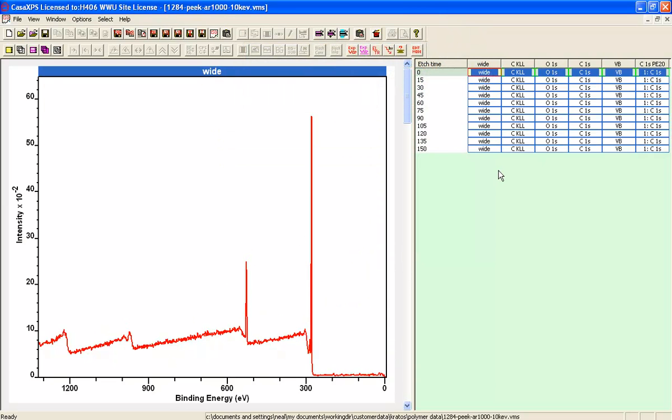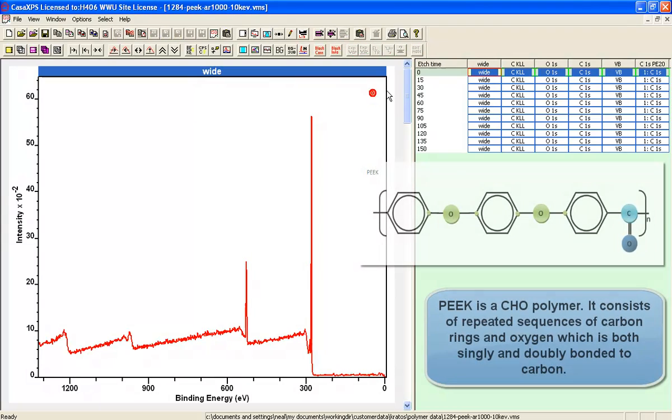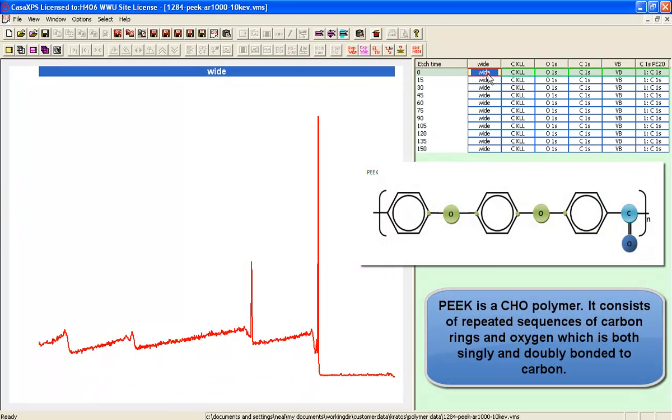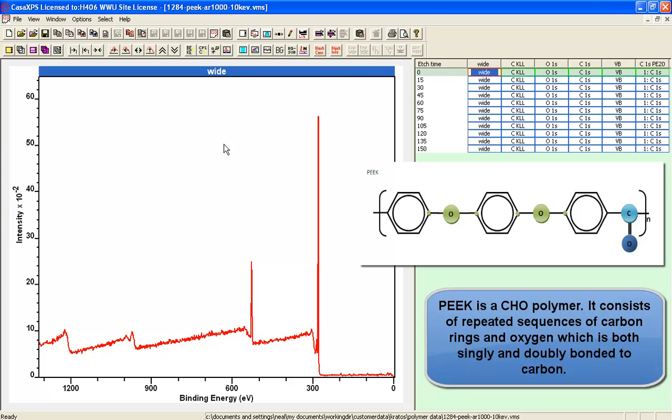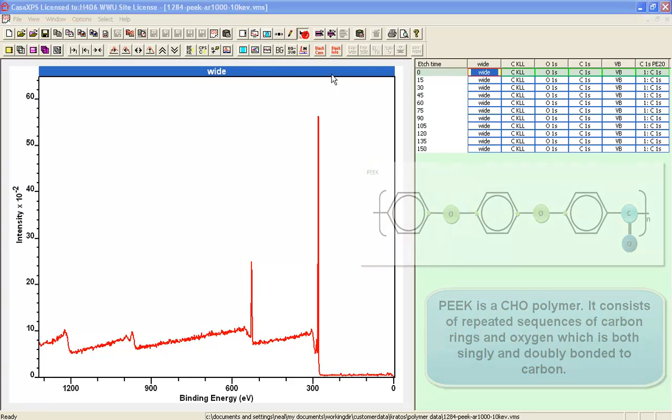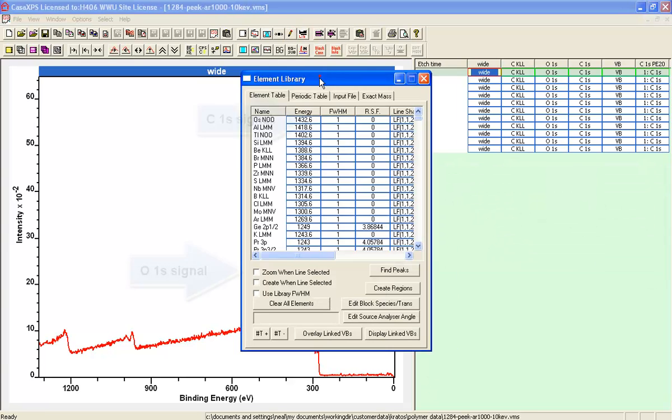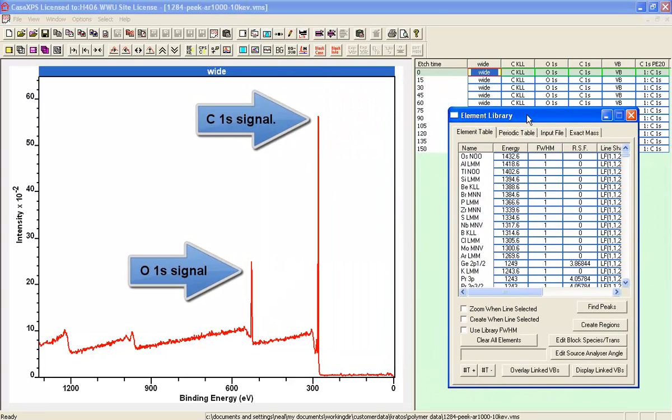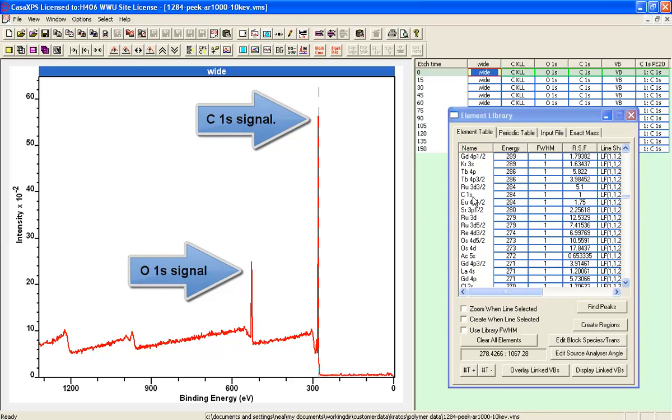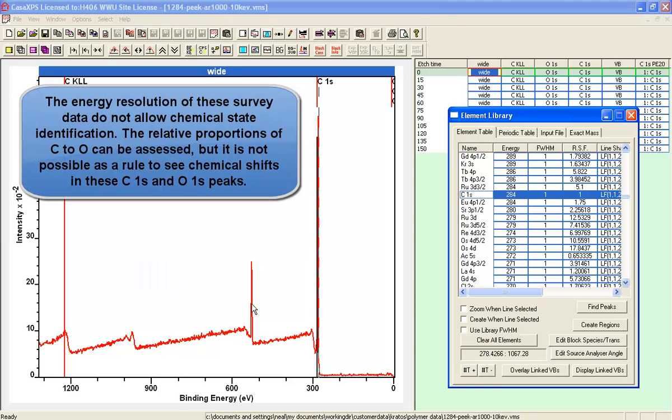We're also doing more bookkeeping where we are assigning the correct pass energy for the different measurements. The survey was done at 160, the Auger oxygen carbon 1s and valence band at 40 pass energy, and one additional carbon 1s at pass energy 20.